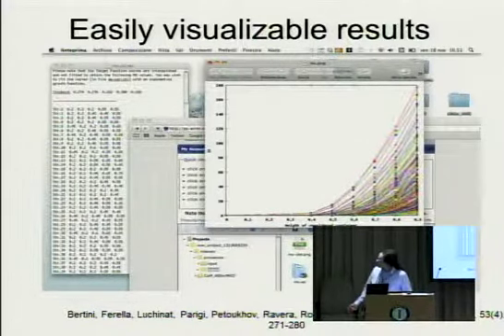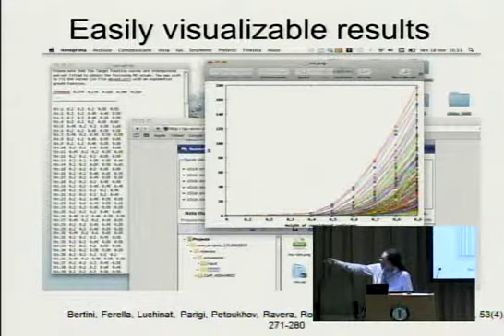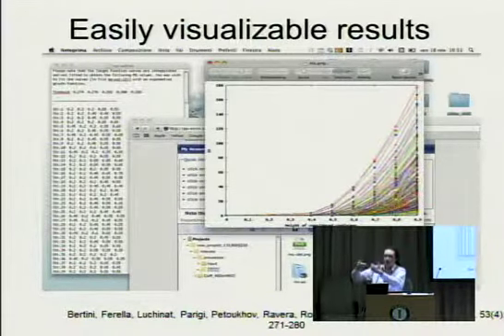So let's say the interesting part of the calculation is when you start increasing the weight of the conformation from which you start building the ensemble. Because if you weight that single conformation very, very low, then you can always build an ensemble that will satisfy the data.